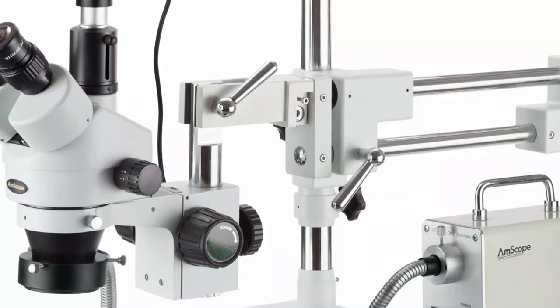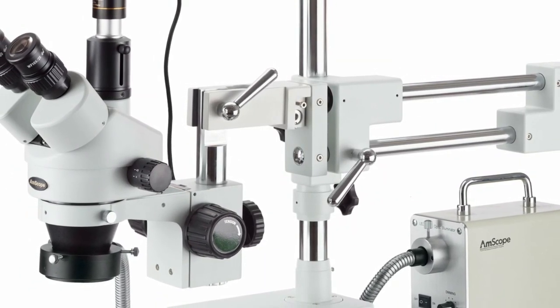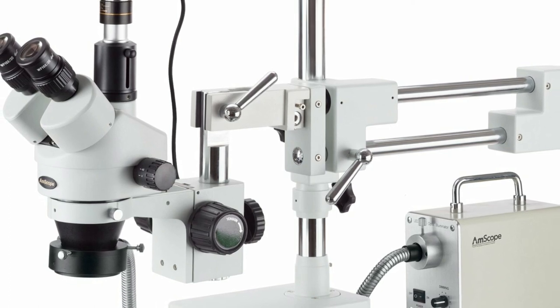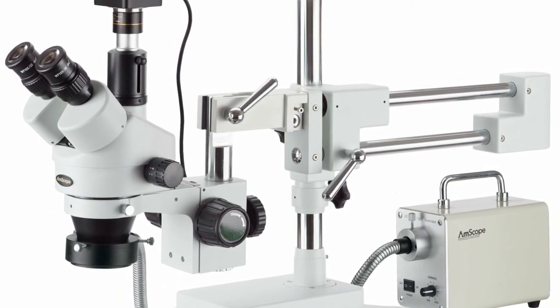This aspect of the microscope makes it easier to observe both light colored and dark colored objects given that the frosted stage is reversible black and white. With this feature, contrast is enhanced regardless of whether the specimen is dark or light in color.